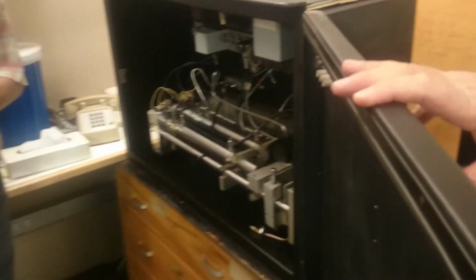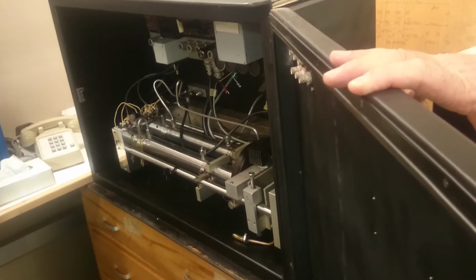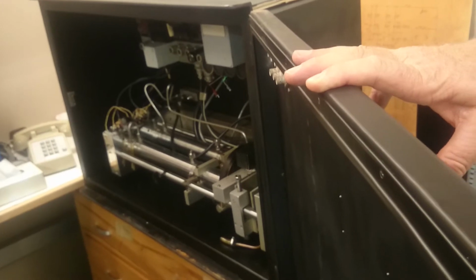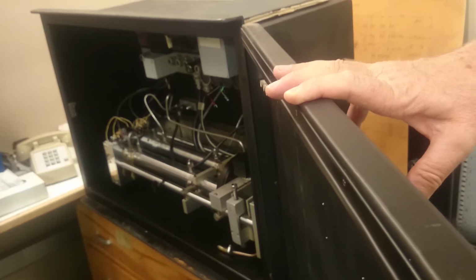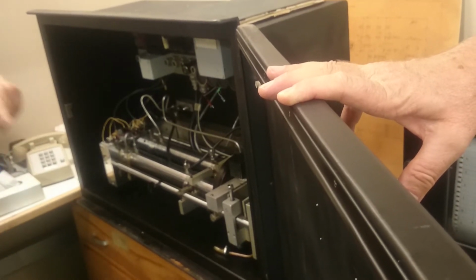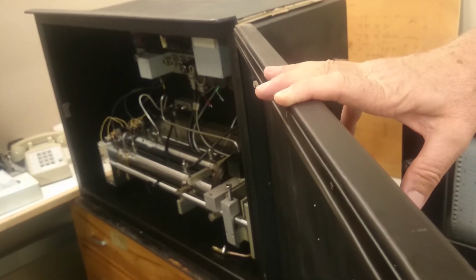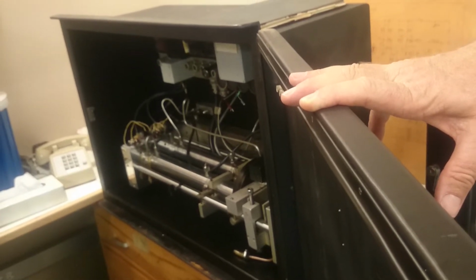The way this works is you measure the absorption of infrared light, and you can do CO2. As a light source, it simply uses a glowing bar, which is sort of hot red, so it emits a lot of near-infrared radiation. But it's emitting all these different wavelengths, and only a very few select wavelengths were actually absorbed by the CO2. So how did they make it sensitive? The way they made it sensitive was by having the detector actually be a cell of CO2 itself, pure CO2. Actually, CO2 and argon, but concentrated CO2.